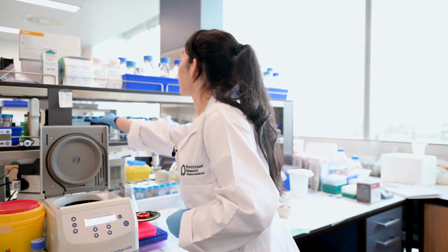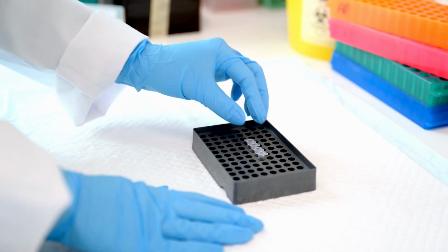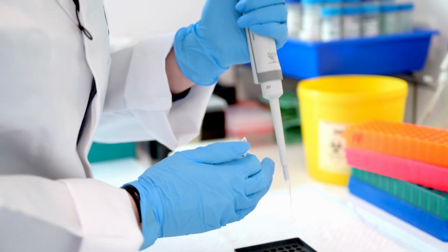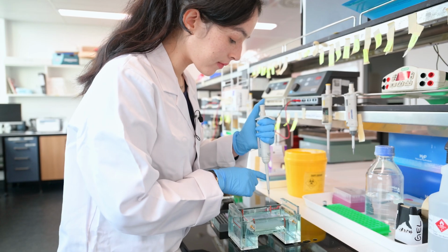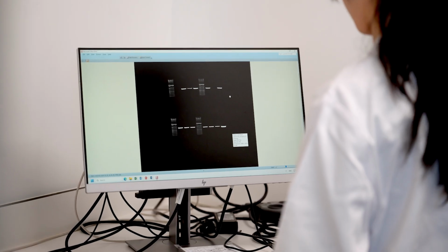So once we've planned the gene editing on the computer, it's time to build a construct that we'll use in real life in the lab. Gene editing takes lots of different components, and we combine them together into a construct and insert that into bacteria to make lots of copies. Then we use techniques like PCR to check that the bacteria has the correct construct, so we know which bacteria to use going forward. We use agrobacterium to deliver CRISPR-Cas gene editing constructs to plants.